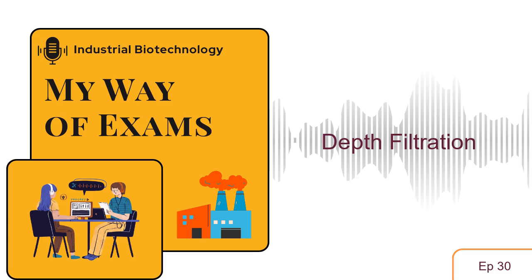Welcome back, everyone. Today we are going deep on depth filtration. I was thinking about it, and it's kind of wild how we can coax these tiny little cells to crank out all sorts of compounds in bioreactors. But then you need a way to actually get that stuff out.